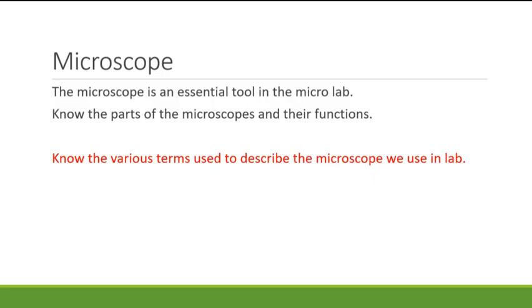Please look in D2L because there is a diagram or a picture of the microscope that you'll be using as part of your assignment, and there is a review list of terminology to help you as well.